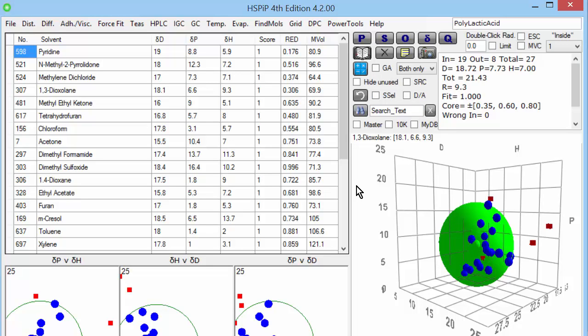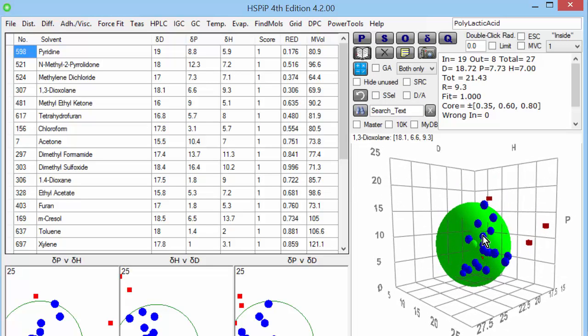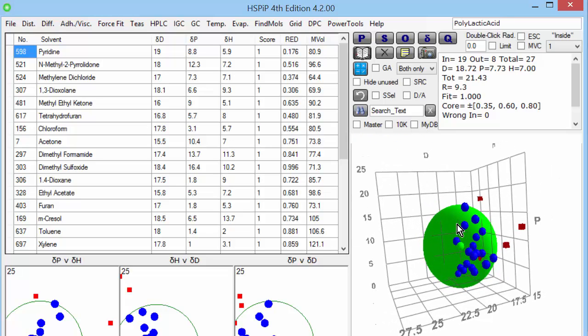The sphere, in green, has all the good solvents, the ones in blue, all the ones inside this green sphere, and all the bad solvents, in red, outside.